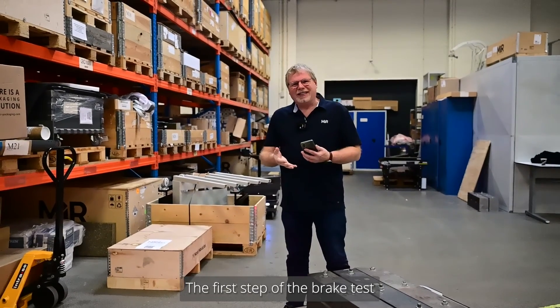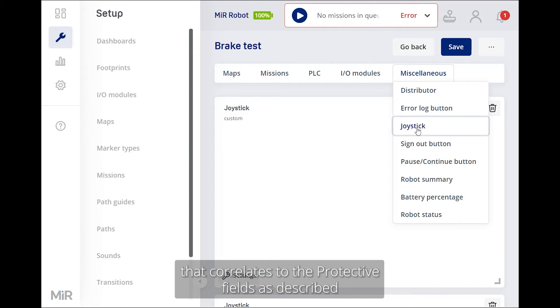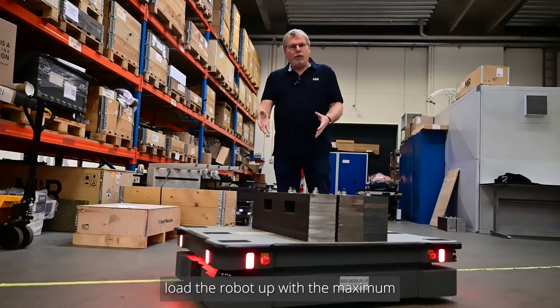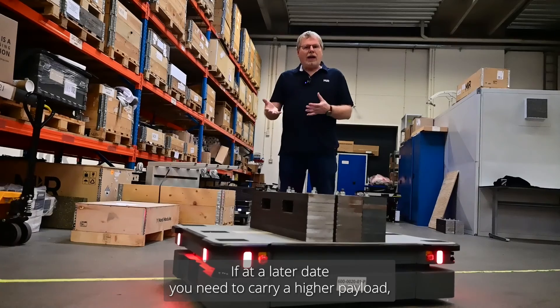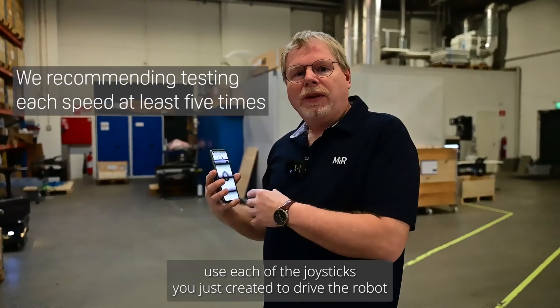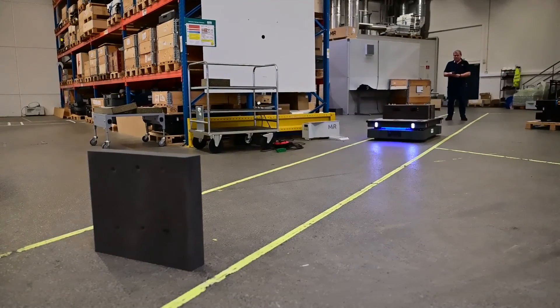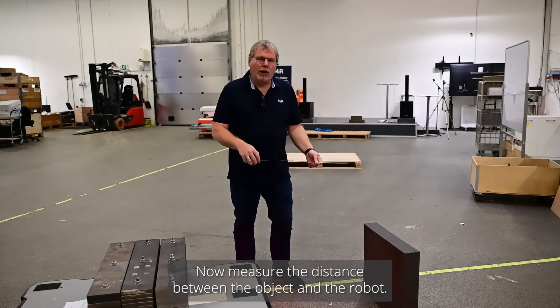The first step of the brake test is to create a dashboard with joysticks that have customized speeds correlating to the protective fields, as described in the user guide. Load the robot up with the maximum payload you will be traveling with at any one time — if you later need to carry a higher payload, you need to perform a new brake test. Use each of the joysticks to drive the robot towards an object, then measure the distance between the object and the robot.